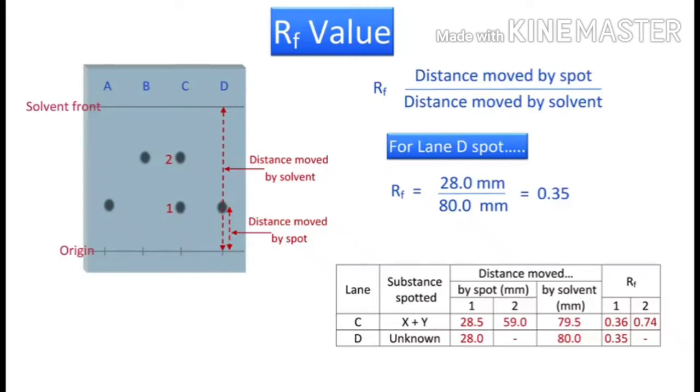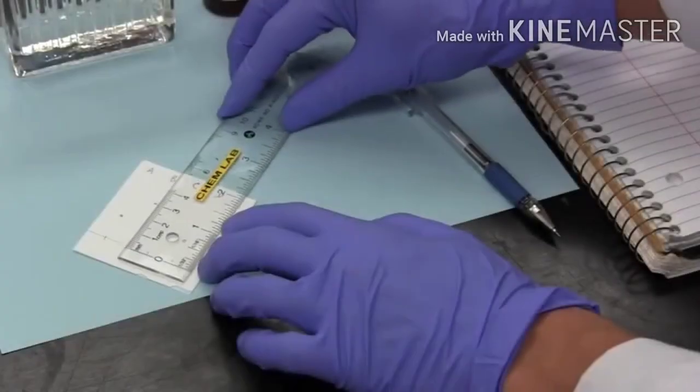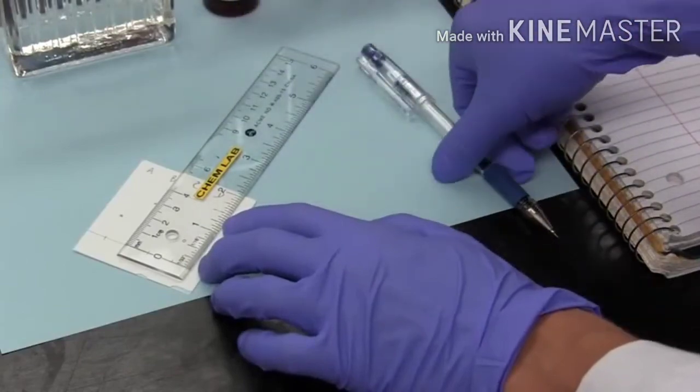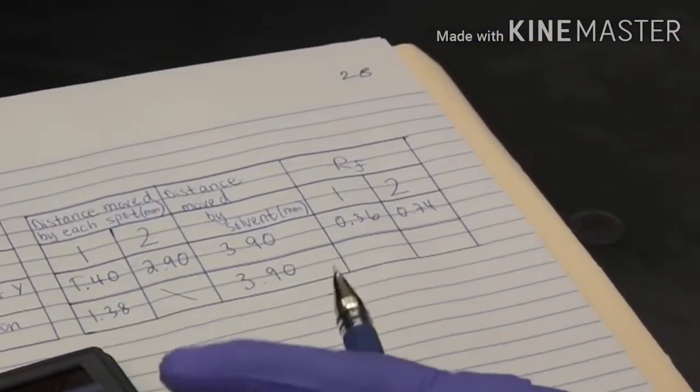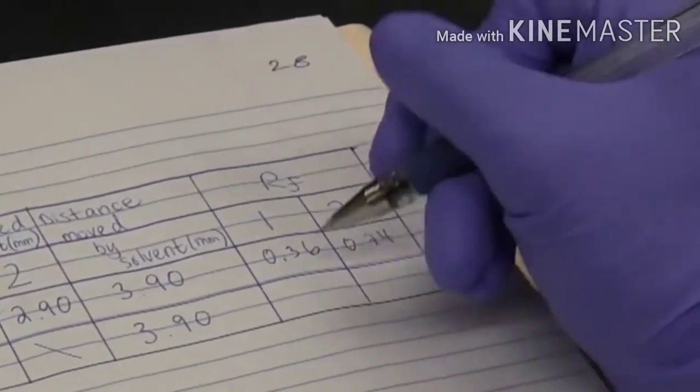In this example, the RF of 0.35 for the single spot in lane D compares favourably to the RF of standard X in lane C, so we can confirm that the unknown was in fact compound X. Here we see the measurements being made and recorded in the notebook. RF values calculated and also recorded.